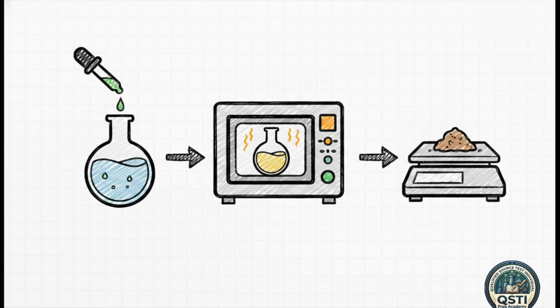Then we take the remaining sample, add a very specific chemical, ammonium hydroxide, to neutralize it, dry the whole thing in an oven, and weigh the resulting mass. By figuring out exactly how much sulfate we have, we're basically teeing up our final deduction.